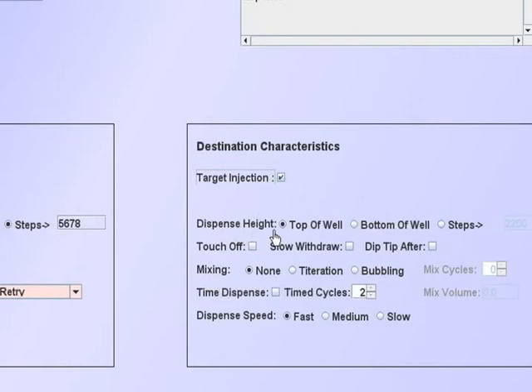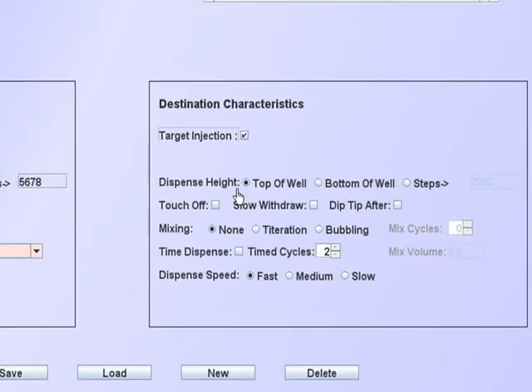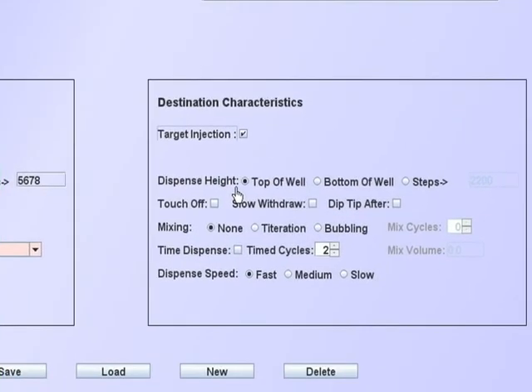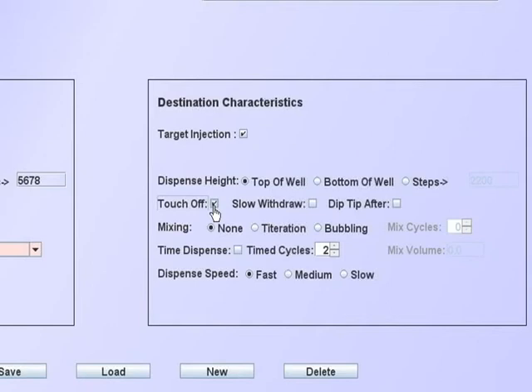The dispense height is self-explanatory. The actual dimensions come from the plate database. If the touch-off function is checked, the tip will move to the top of the well and touch-off on the sidewall.